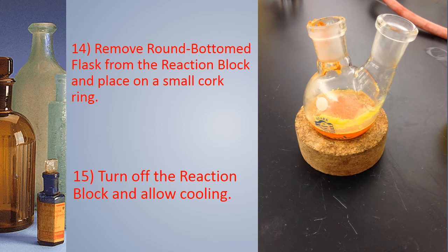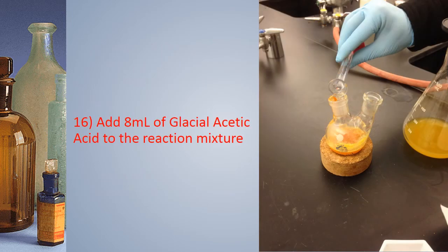We may then remove the round bottom flask from the reaction block and place it on a small cork ring. We turn off the reaction block and allow cooling. The next step is to add 8 milliliters of glacial acetic acid to the reaction mixture.